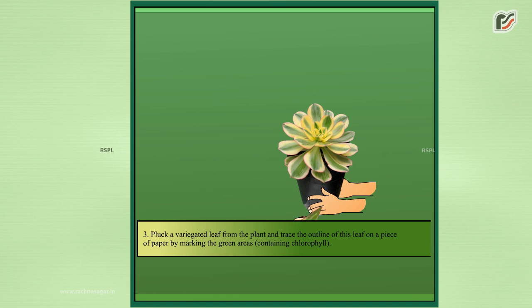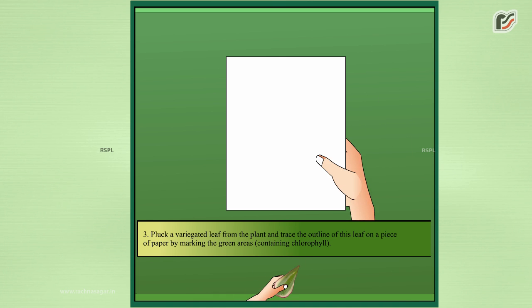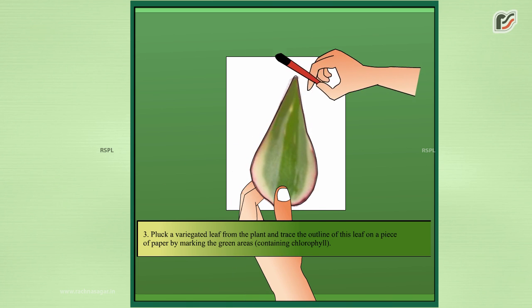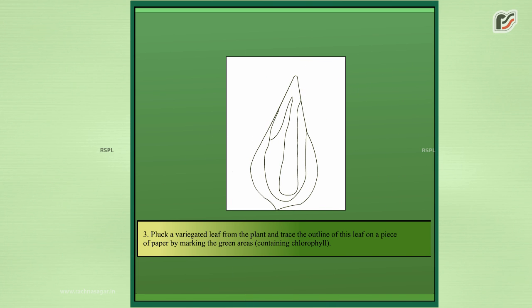Pluck a variegated leaf from the plant and trace the outline of this leaf on a piece of paper by marking the green areas containing chlorophyll.